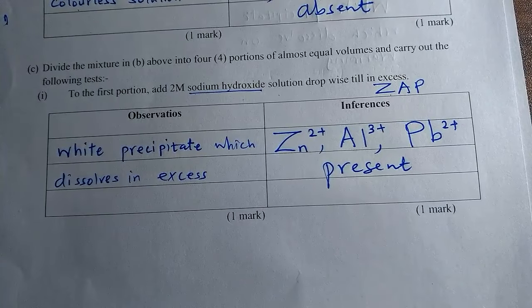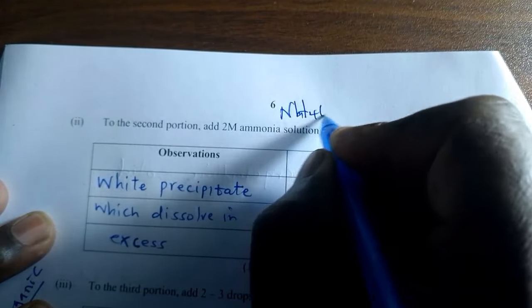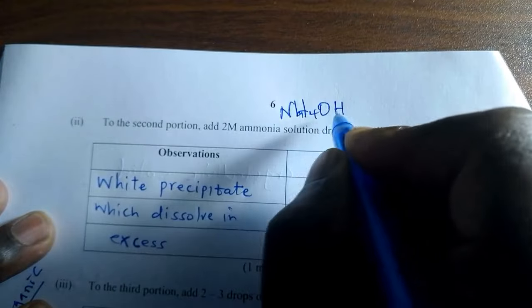The second portion, add 2 molar ammonia solution, dropwise until in excess. Ammonia solution is also ammonium hydroxide. So if you see ammonium hydroxide written, we are talking about ammonia. A white precipitate is formed which dissolves in excess. Ammonia is specifically testing for zinc 2 ions. So if a white precipitate is formed and that white precipitate dissolves in excess, then it confirms that zinc is present.